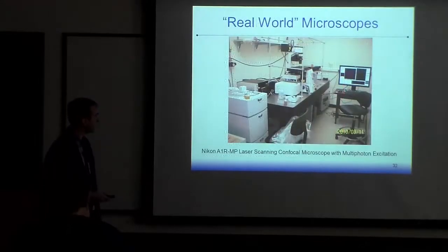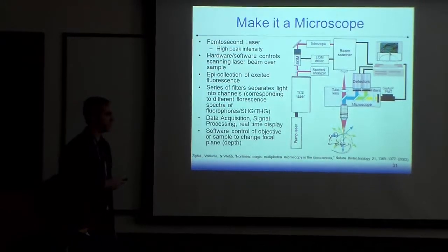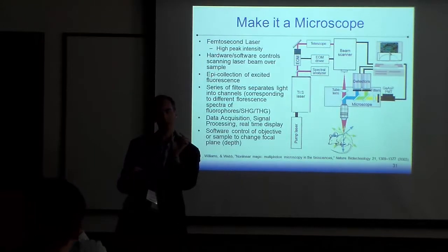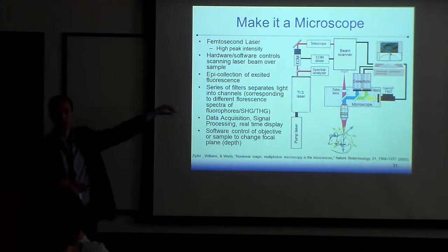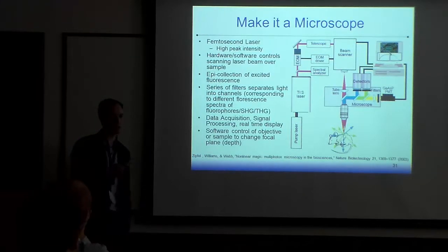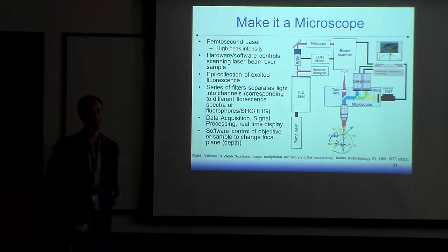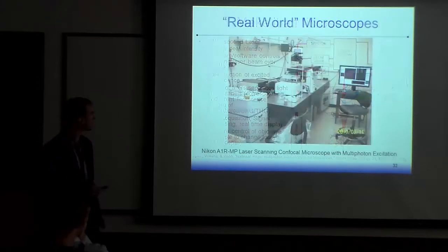Yeah. Is the laser, what is the spectrum of the laser? Oh, so it's like 10 to 20 nanometers width at about 800 nanometer standard wavelength. Yes, about 100 femtoseconds is the pulse width for these. It's interesting, if you get shorter and smaller, you actually start creating thermal shock waves inside the tissue, and it kind of looks like the Death Star when you see an artery rupture and explode. So there's some issues about this thermal shock. So about 100 femtoseconds is nice.